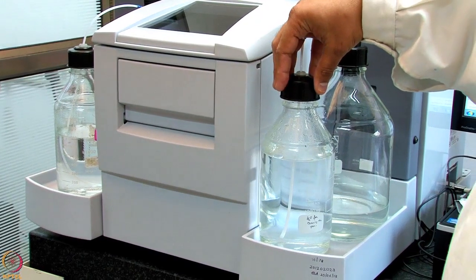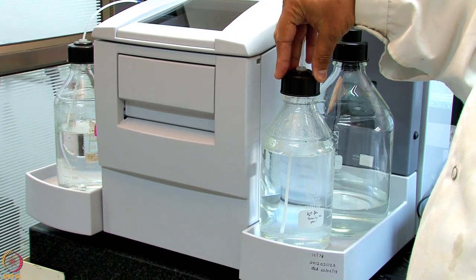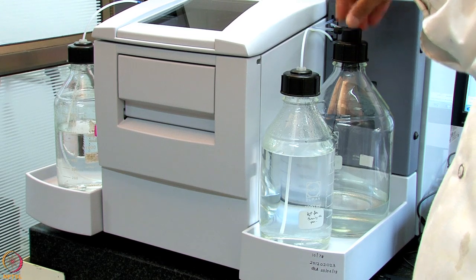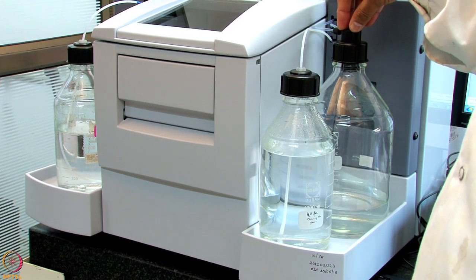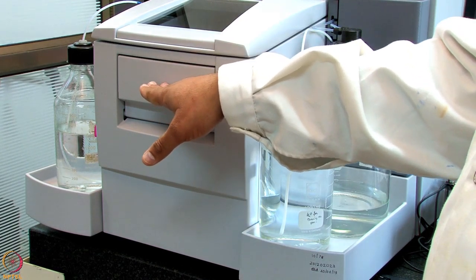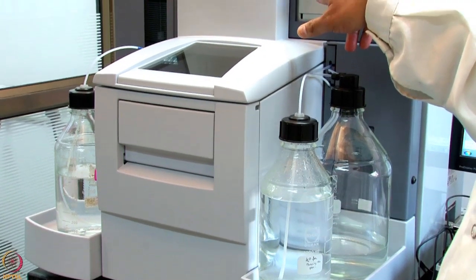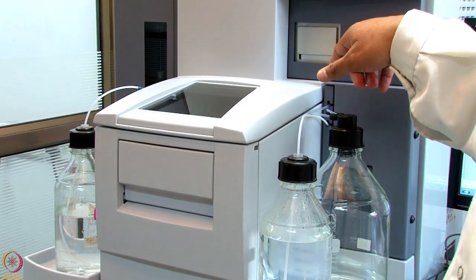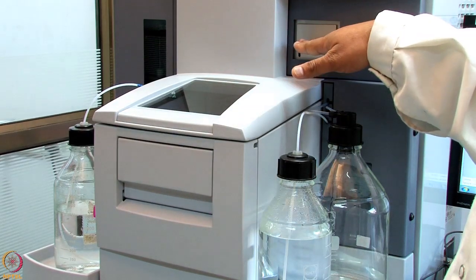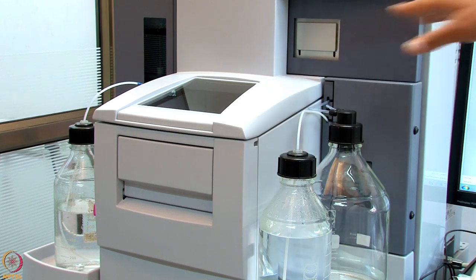Coming here, we have a water reservoir. The water reservoir is useful for cleaning needles and syringe. And we have a waste reservoir here. And this waste reservoir collects all the waste. The samples are actually sent in this compartment. Chip is docked at this compartment. So the experiment starts by picking up samples from this compartment and transferring them here at the interaction site, and then the experiment is recorded on the screen.